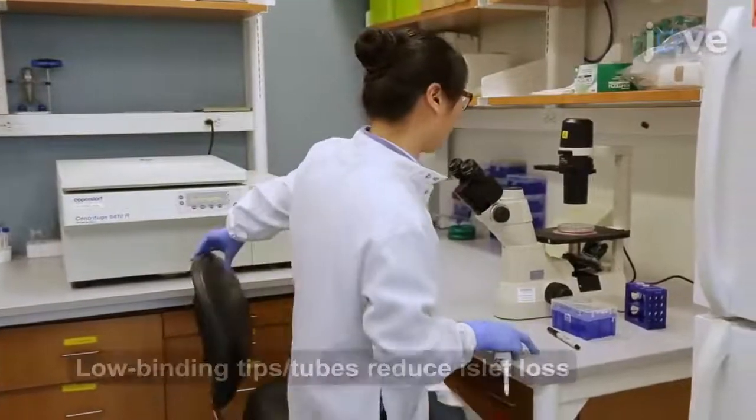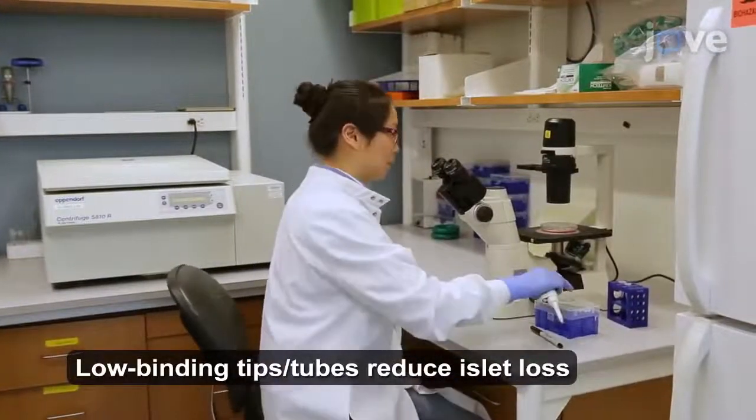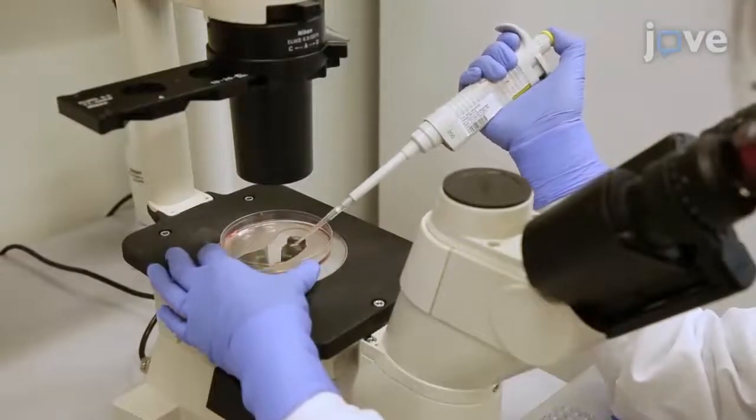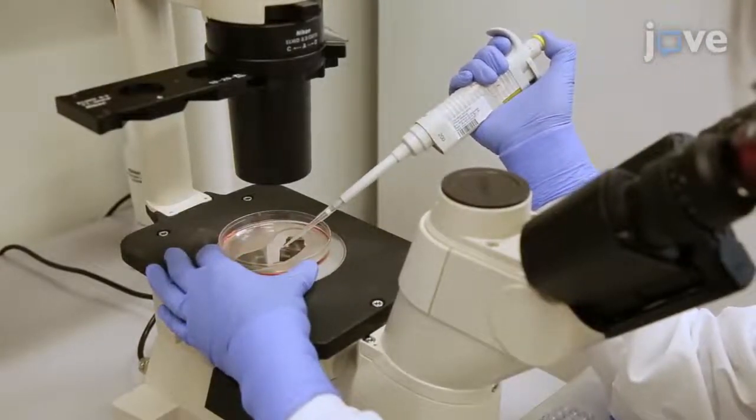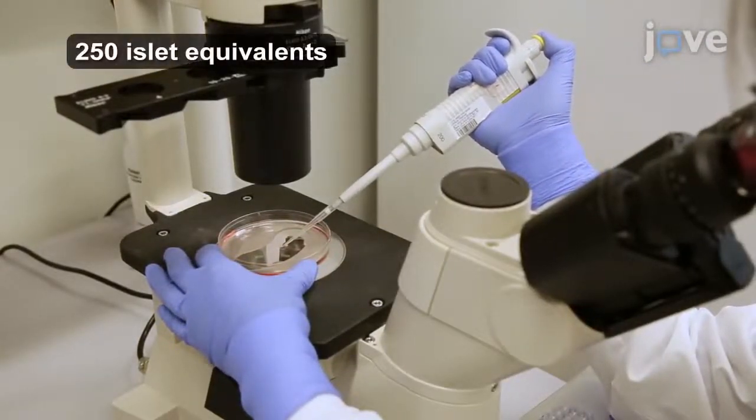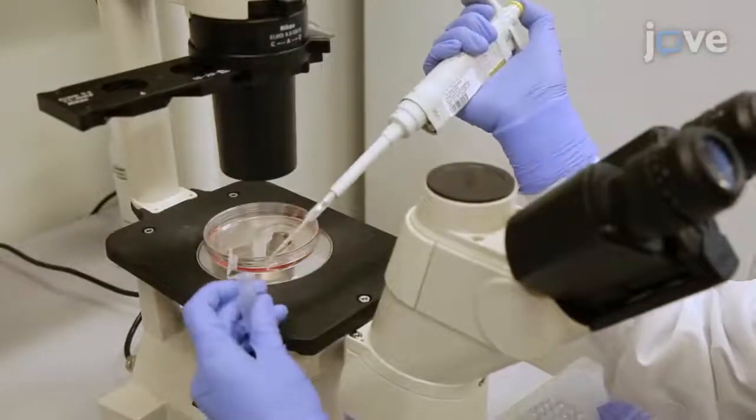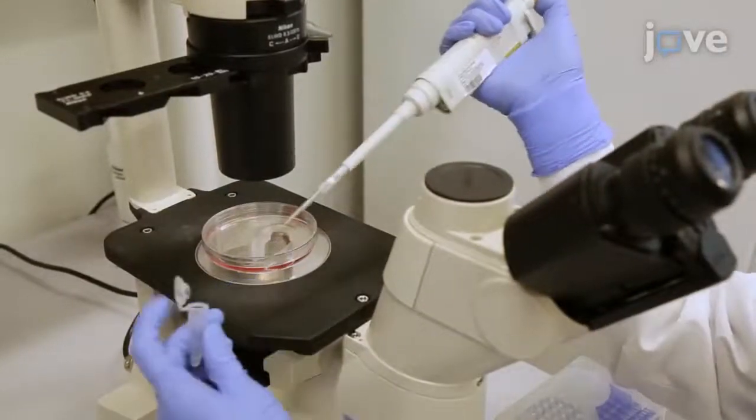To begin this procedure, use a low-binding P200 pipette tip and a calibrated grid under a stereomicroscope to handpick 250 islet equivalents, transferring them into each 1.5-milliliter low-binding microfuge tube.